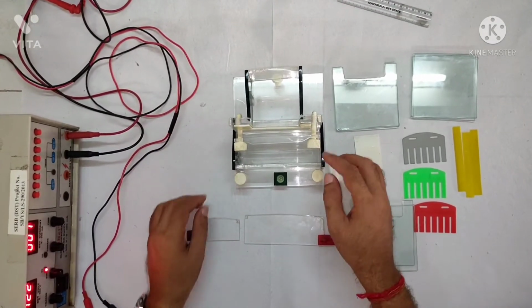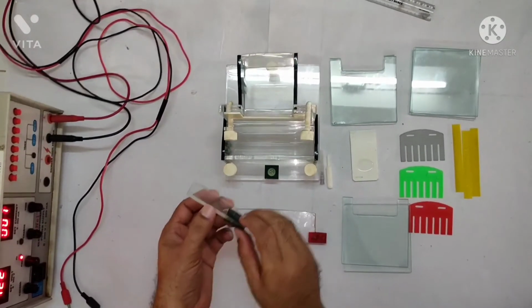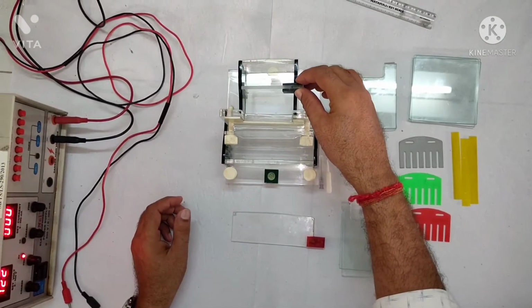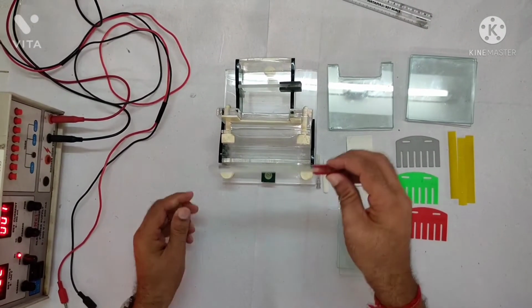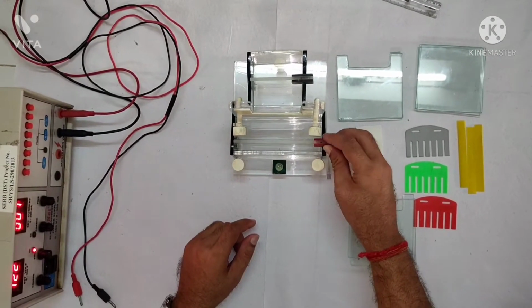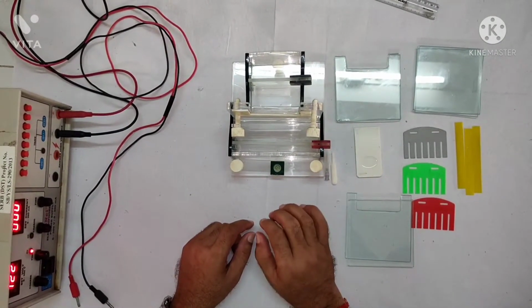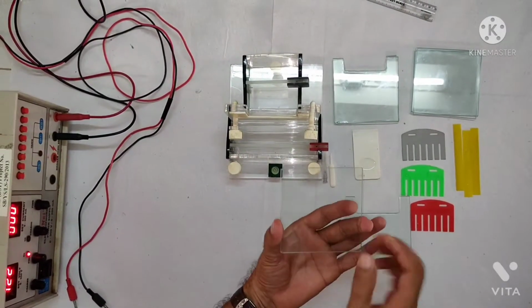So here you can see the two different tanks. This is the upper tank, this is the lower tank. The upper tank has one electrode, this is the negative electrode, the black one, right? And this is called the cathode. The lower tank has another electrode, and this is the positive electrode, or called the anode, right? Another component of the vertical gel electrophoresis is the casting plate.